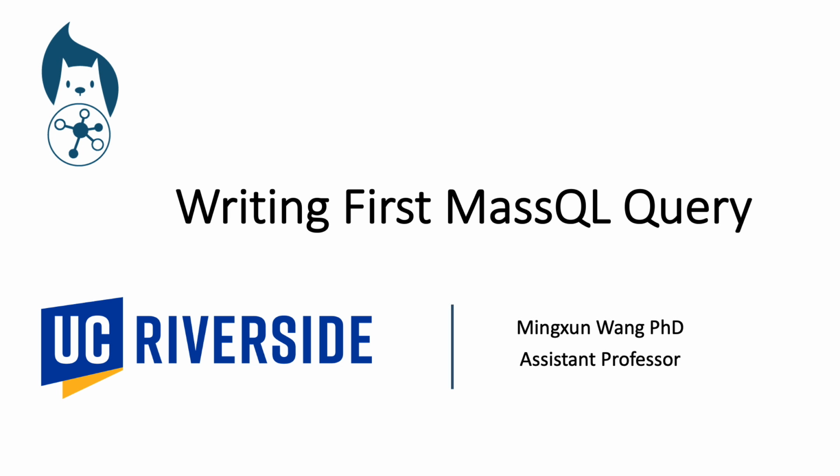Welcome back. Today we will start working together to write our very first MassQL query. You'll learn a little bit about the syntax and some of the tools to try these things out.